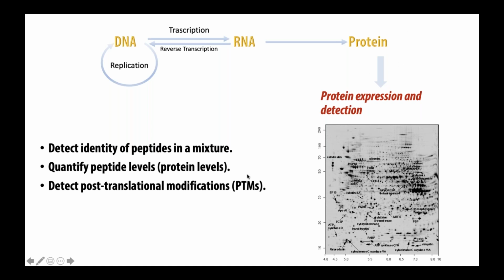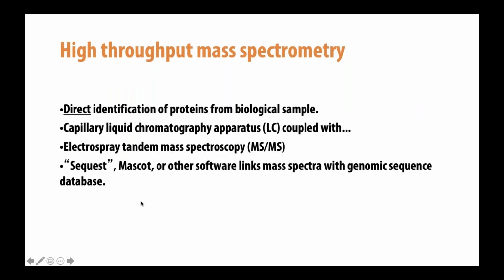you can assay proteins in different ways, but traditionally you used to run this on gels, obviously, and you get all these spots, but these spots are actually proteins or fragments of proteins, and their chemistry basically tells you something about what they are. And of course, high throughput methods rely essentially on the same notion, the chemistry of the peptides, to be able to then identify what those peptides are and the quantity of those peptides.